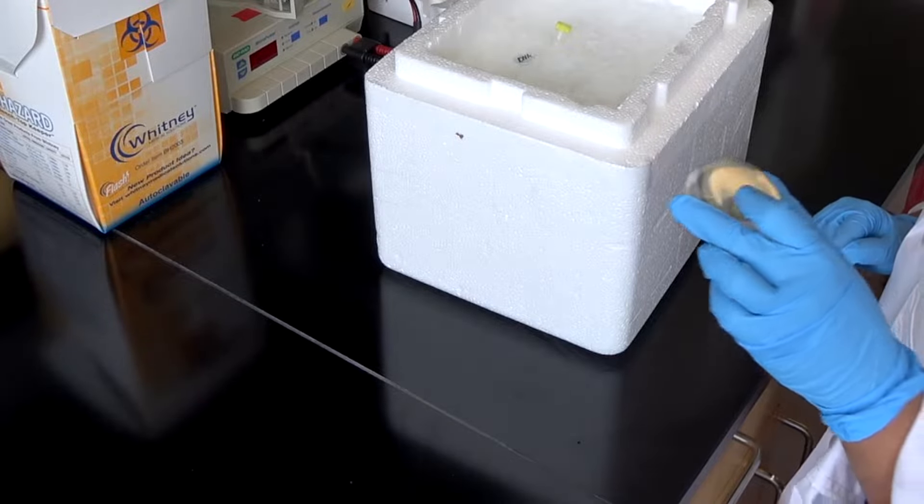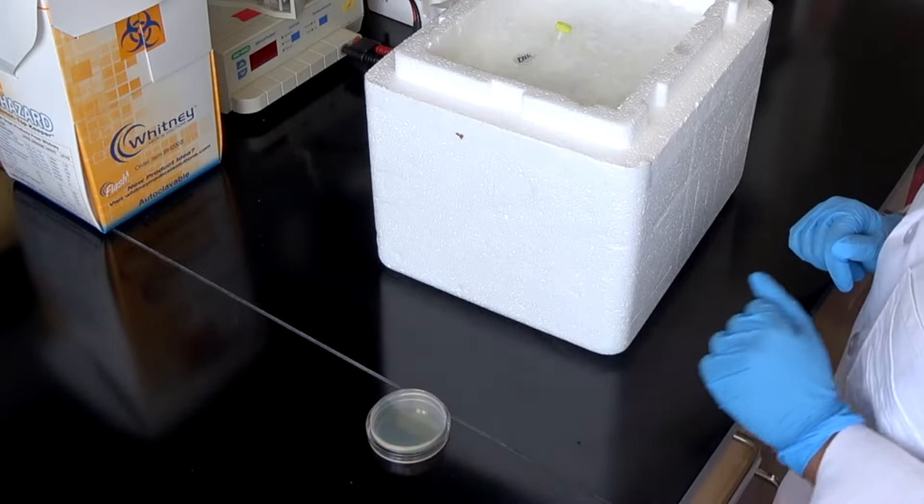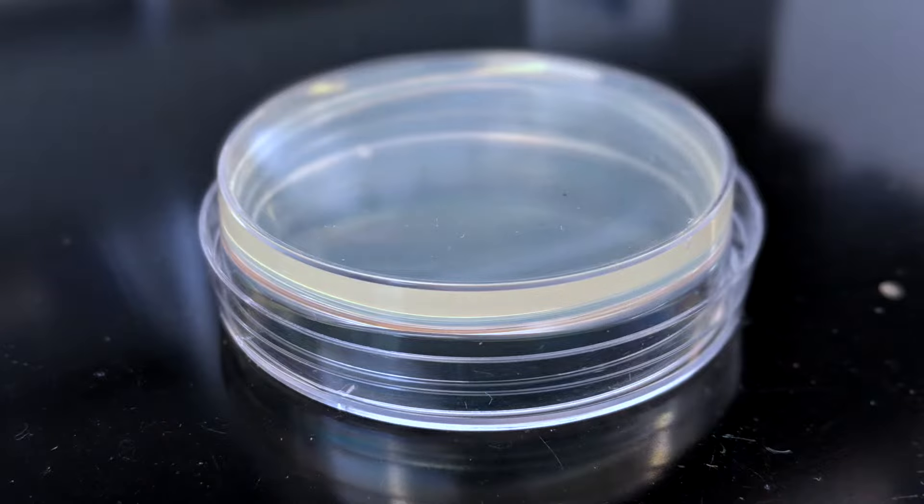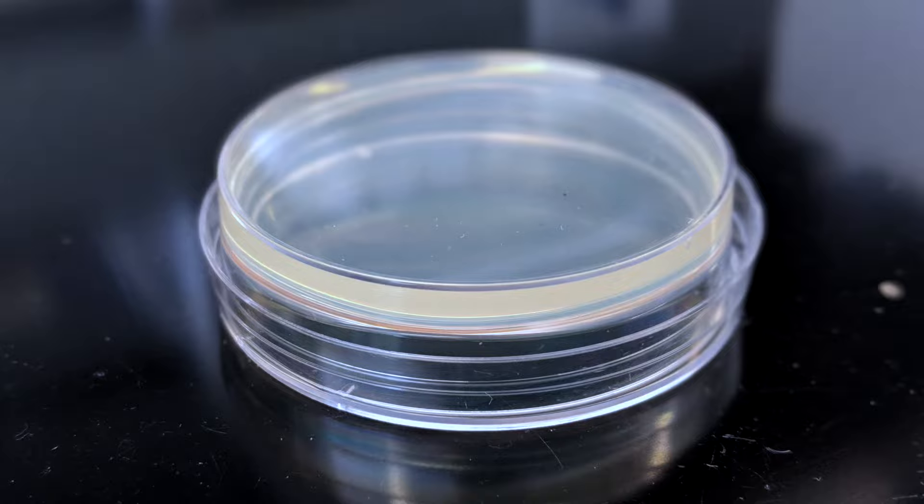As the competent cells thaw, place the appropriate LB-agar plates on your bench. These plates should contain the antibiotic that your plasmid of interest will provide resistance to. The plates will reach room temperature by the time we're ready to spread our transformed cells.